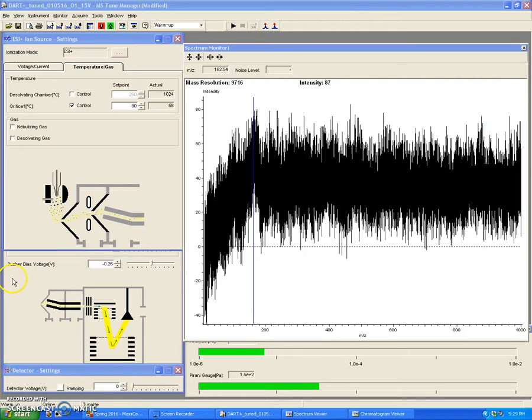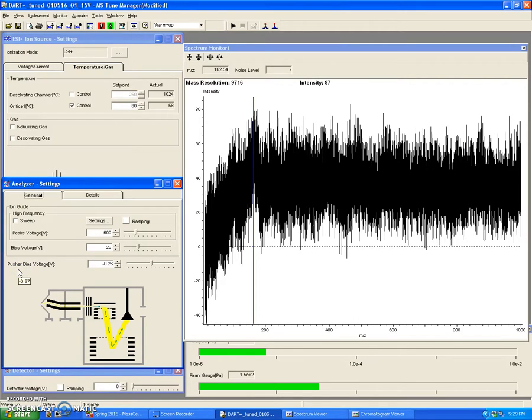The next thing that I do is that once I'm absolutely sure that I'm done doing my analysis, I'll check that the voltages are off, so that the detector is off. Hit enter, just make sure. This is set to warm up, and this is set to stop. Everything else you can ignore, and now you can proceed to your data analysis, which will be in another video.